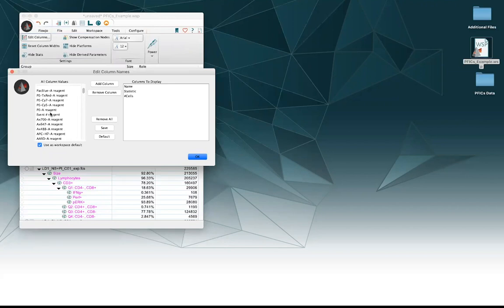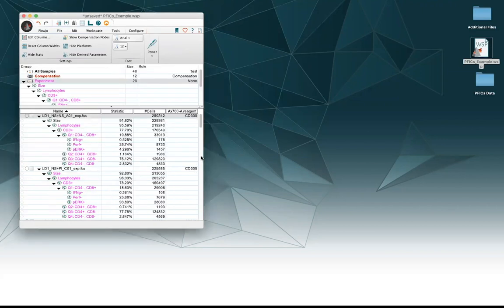I'm going to have to remember what stain is associated with the CD3 parameter. Luckily it's this one. Add the column, press okay. Now you can see there's a whole column with my stain name for the ax700 detector.